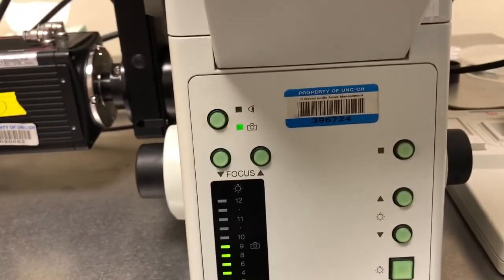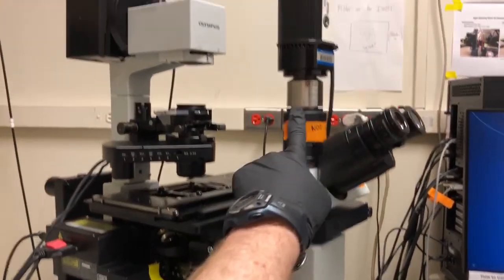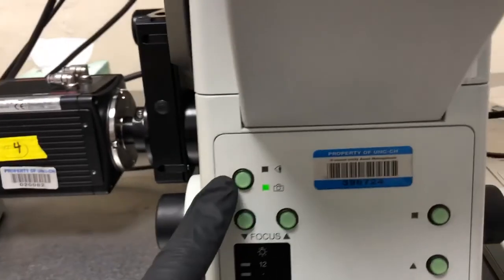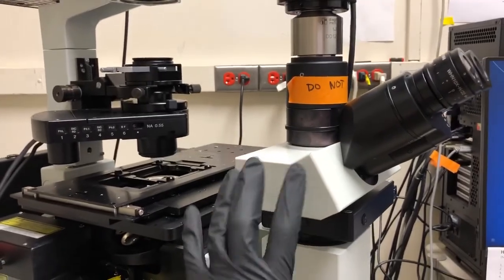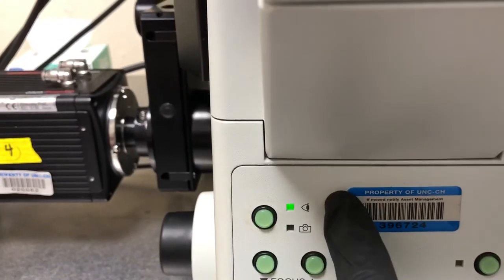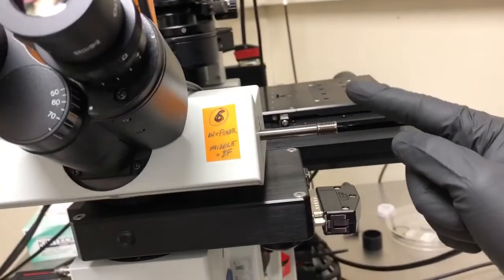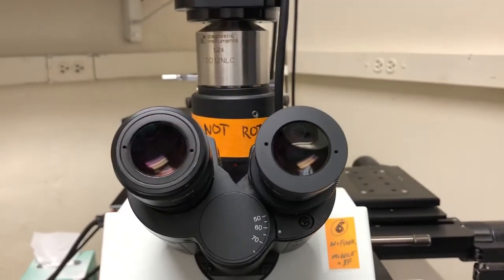This microscope has three places where the light can go once it hits the sample: the eyepieces, this camera, or that camera. To control whether the light goes to this camera or to this section of the microscope, we use this button. Because we will be looking either by eye or with this camera, we always want the light going to this part of the microscope, so we should always have it in eyepiece mode. In the middle position the light goes to both, which is the proper setting for bright field.